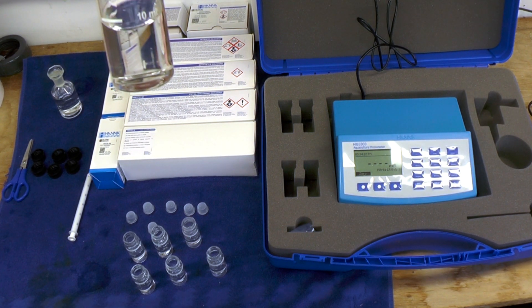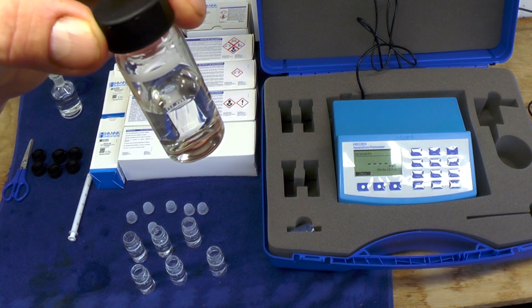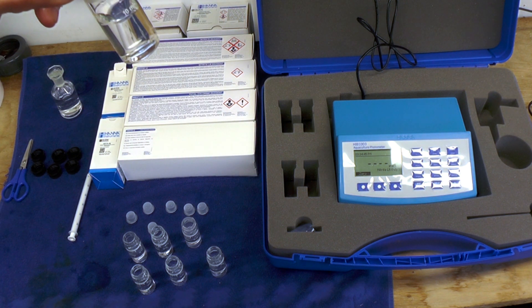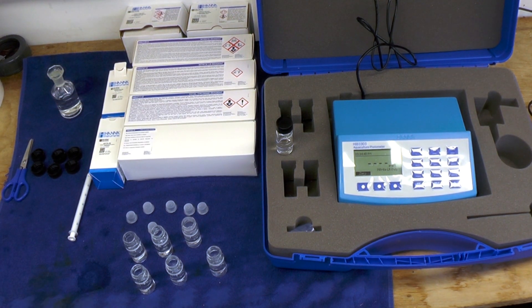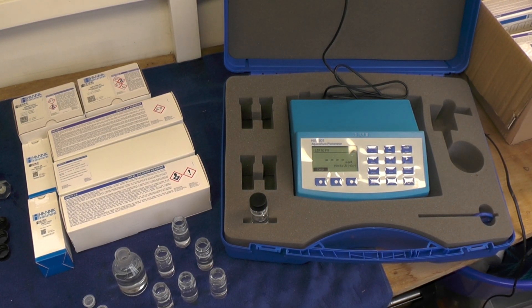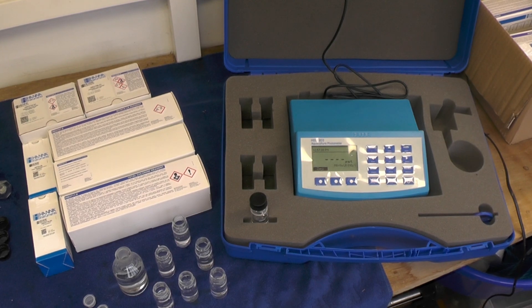Each cuvette has 10ml of pond water in it. This one I'm going to keep aside as the original to set and calibrate the unit; the rest I'll fill with reagents to do the individual tests. There were originally eight cuvettes but I dropped one and broke it, so I've only got seven at the moment — not a problem, just rinse and reuse. I've adjusted the camera angle to get a better view of the screen. Next we're going to do the alkalinity.